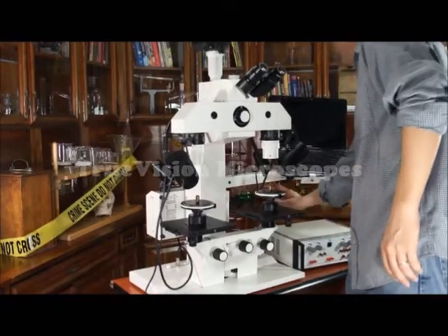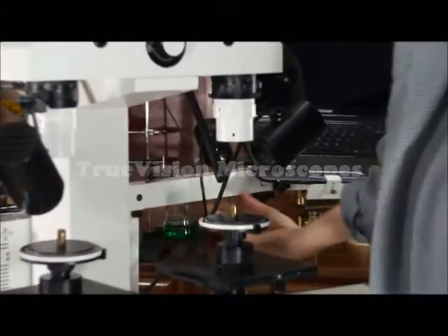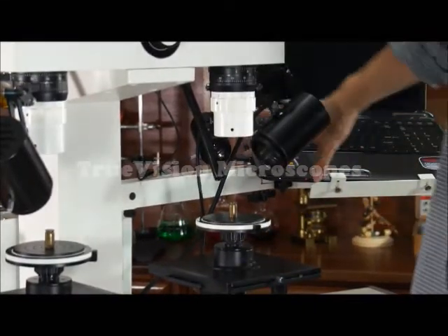This whole frame is solely for the laptop. It can be taken off if you're not using your laptop, but it's very convenient.